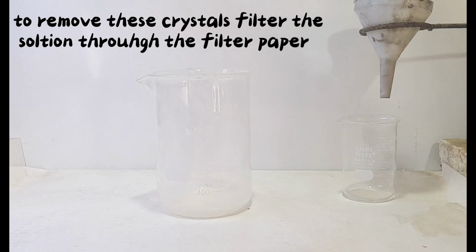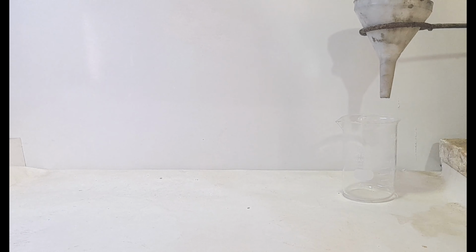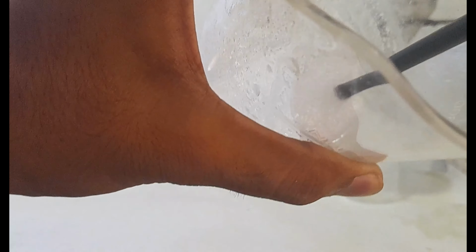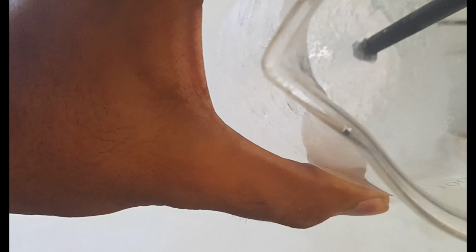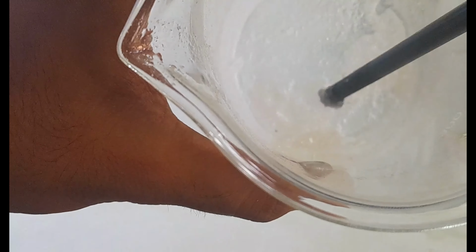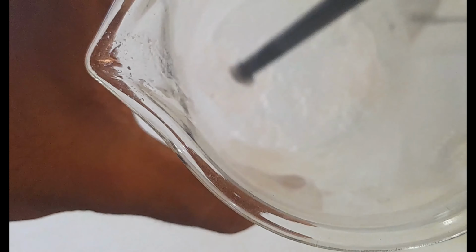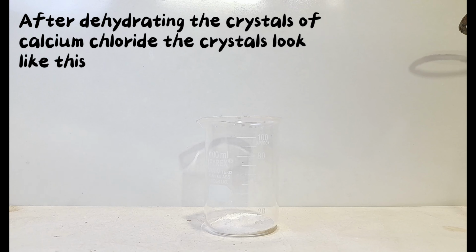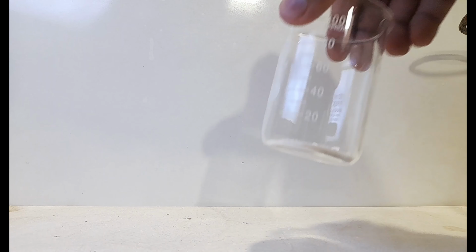To remove these crystals, filter the solution through the filter paper. After dehydrating the crystals of calcium chloride, the crystals look like this.